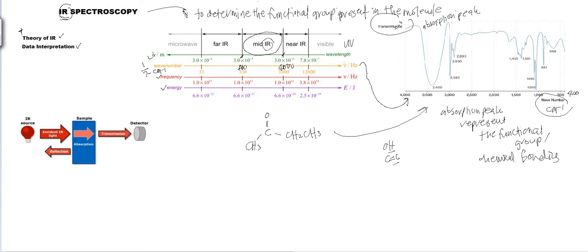Jadi for example, you are synthesizing ataupun preparing the product, for example the chemical, so you know that you are combining chemical A with chemical B, which is the reactant, and then the product is product C, right? Okay, so you know that chemical A macam mana, how it looks like, the chemical B, how it looks like, right? You know all the functional group involved.